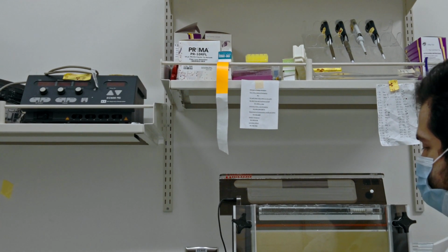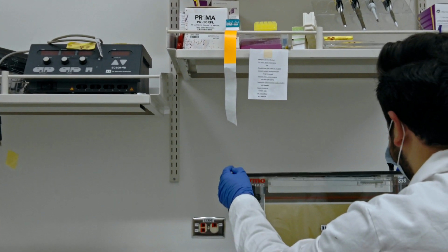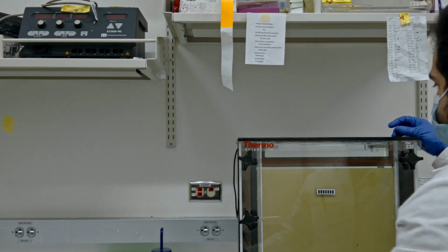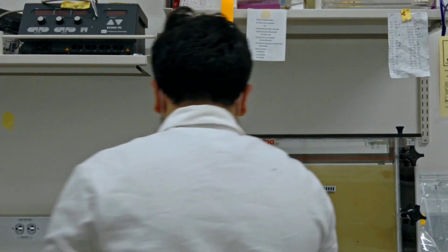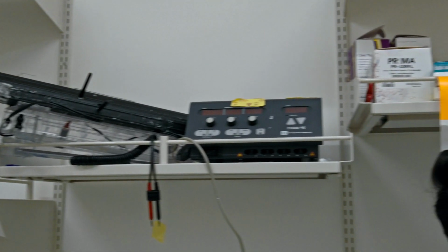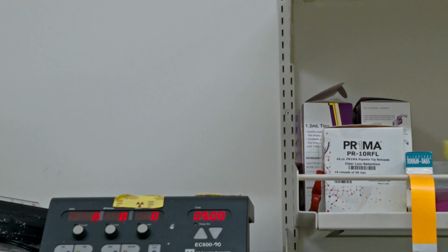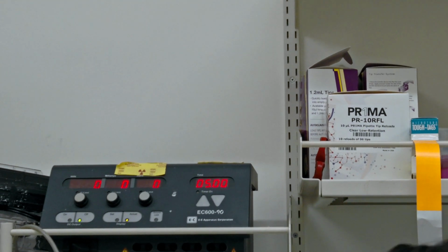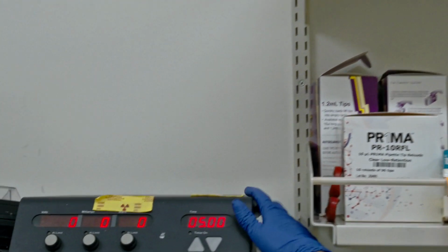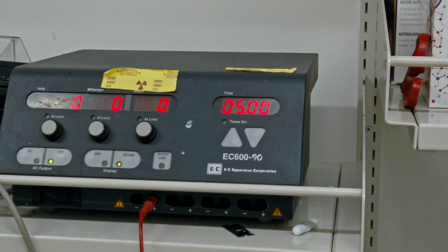So now it's time to get the gel started. We do this by first closing the top, then sliding it. If you hear that click right there, that means that you have effectively closed the top of the gel. Next thing we're gonna do is plug in the power generator. We're gonna flip the switch to on. Currently it's not running just yet. We have to put the negative and the positive end into the instrument. Make sure that you put it in the right color and the right spot. So black with black, red with red.